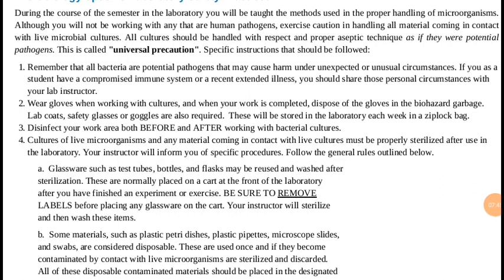In the next lab, we'll be talking about how to sterilize. Therefore, we'll talk about that next class. Now, these are normally placed on a cart at the front of the laboratory after you finished an experiment or an exercise. Be sure to remove labels before placing any glassware on the cart, so that later they can be sterilized and then this glassware could be washed.